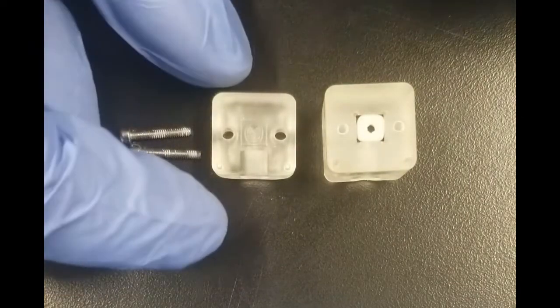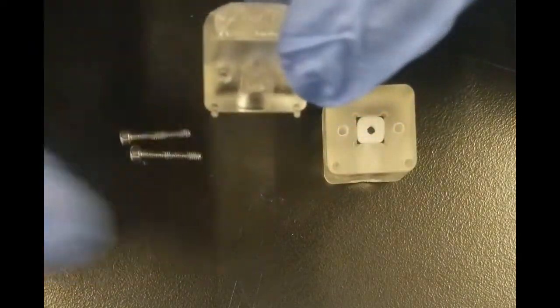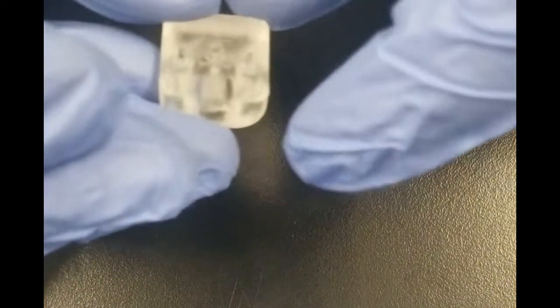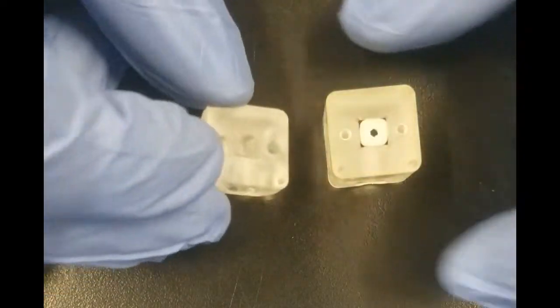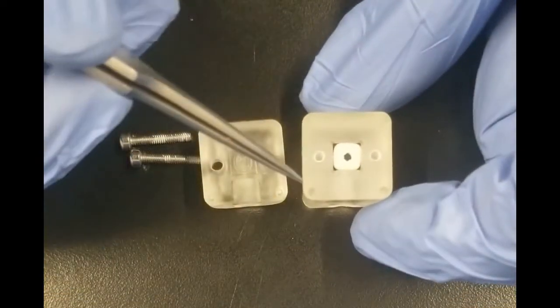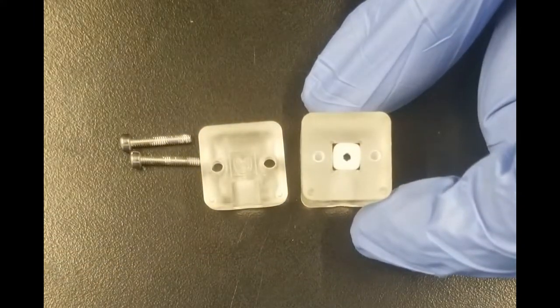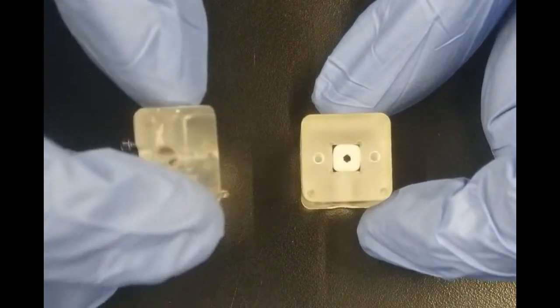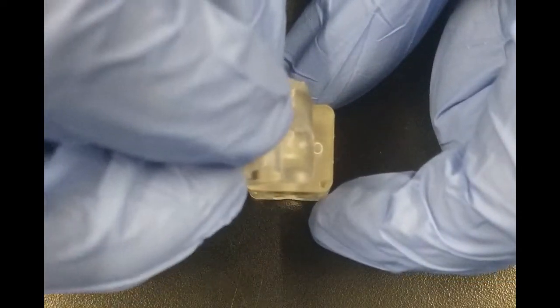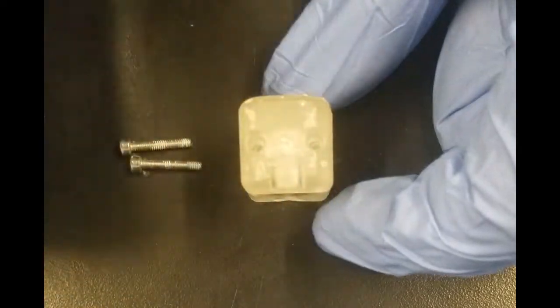The first thing to note is that the top half cell has alignment pins near the top face. Those alignment pins will go into the ports on the larger bottom cell. First thing I will do is flip over this top half cell, ensure the alignment pins are lined up, and rested in place.